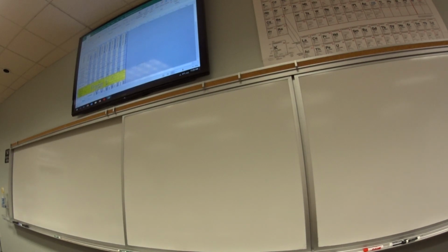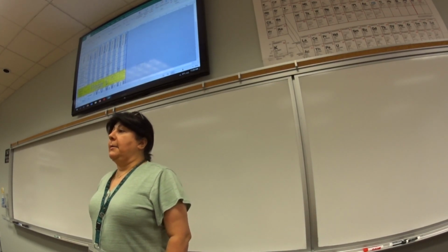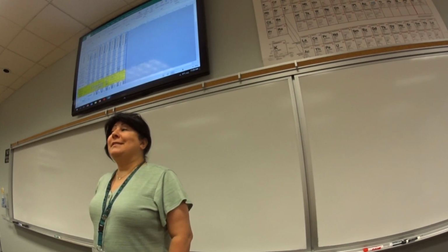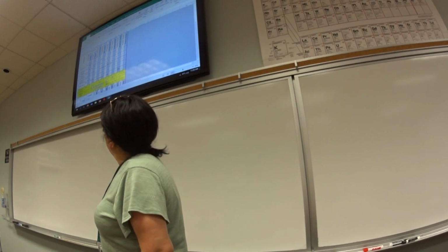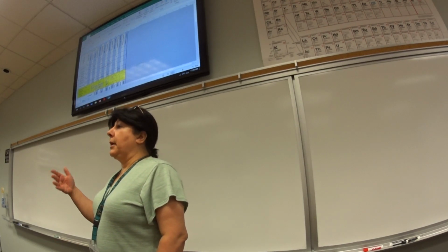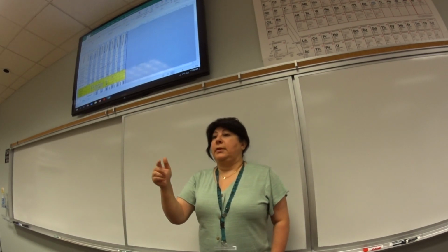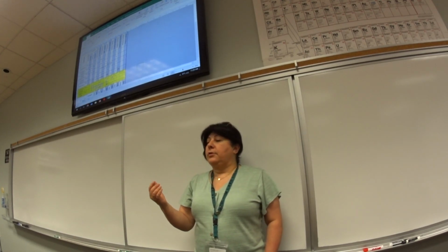But search and find the name of the media. You can't come to me and say, I'm going to do citrase activity. I'm like, great, what's the media you need for that? So you order a Simmons, okay? Then you order gelatinase, gelatin for me. Caseous, milk agar, okay? Anything like blood or anything like that, if you want, again, you can order. So you say, I need one of these. I'm gonna tabulate what each person needs, and I'll go through it.